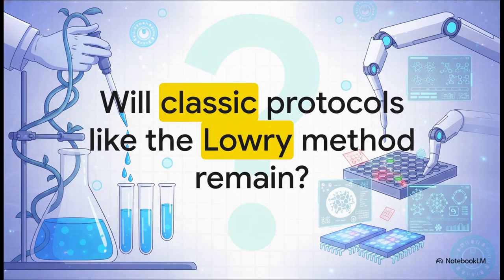Which actually brings us to a really compelling final thought. We've seen exactly how intricate and hands-on the Lowry method truly is. But as automated, microvolume technologies continue to rapidly advance, and all these alternative assays keep emerging, will classic, multi-step bench chemistry protocols like the Lowry method remain the gold standard? Or are these beautiful blue tubes ultimately destined to become just a nostalgic chapter in laboratory history? Well, something to think about.